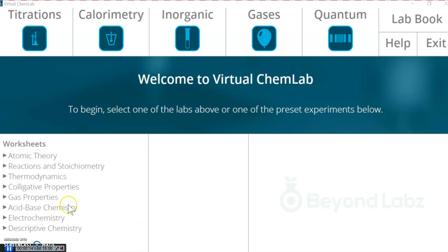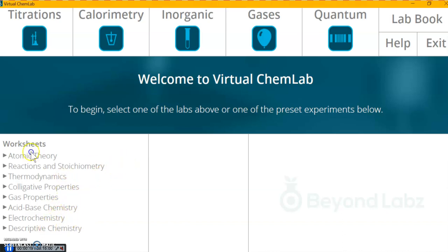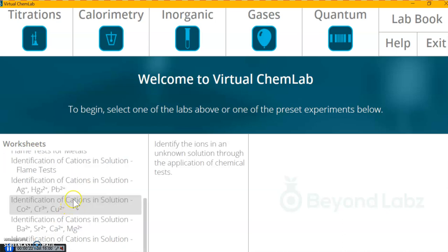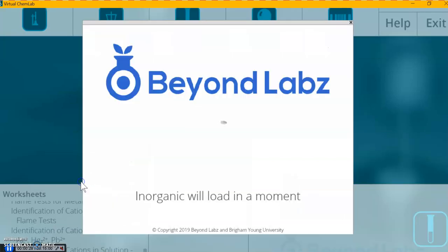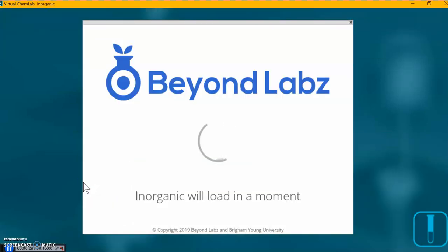So I've already opened the virtual chem lab. In Beyond Labs, I'm going over here to Descriptive Chemistry, then Identification of Cations. Here, this is the one we want: Silver, Mercury, Lead. Opening it up.